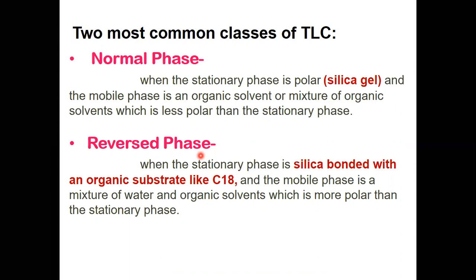Reverse phase TLC is when the stationary phase is silica, but the polar silica groupings are bonded with an organic substrate that is non-polar, like C18 molecule, octadecyl molecule. And the mobile phase is a mixture of water and organic solvent, which is more polar than the stationary phase.